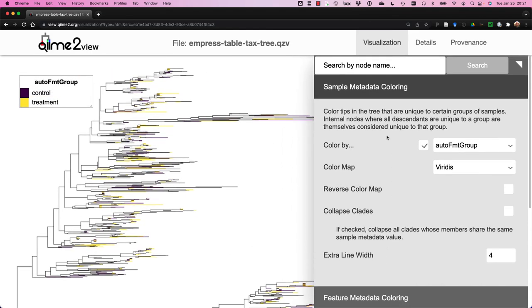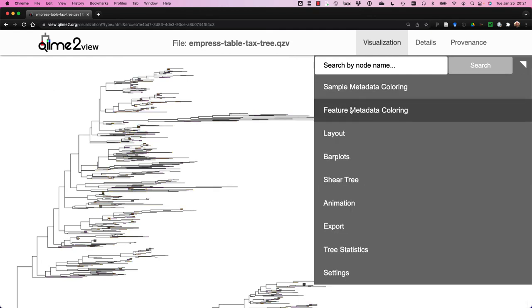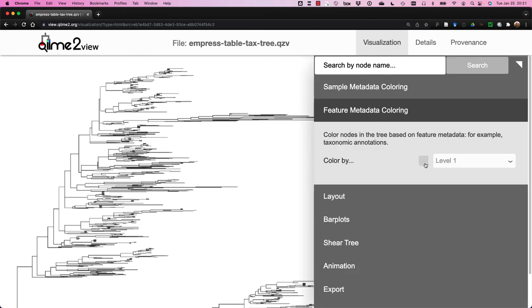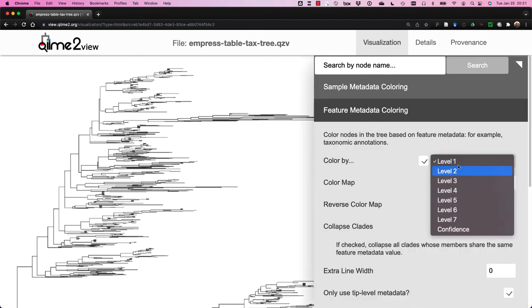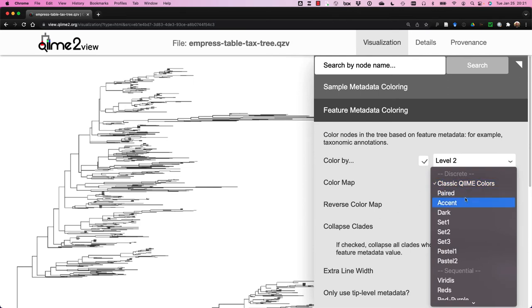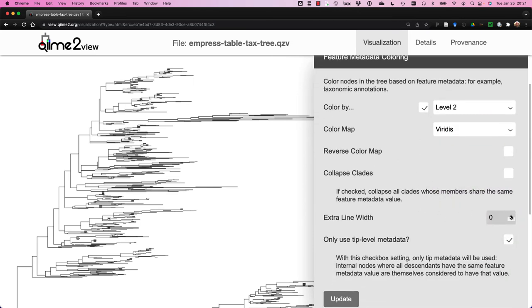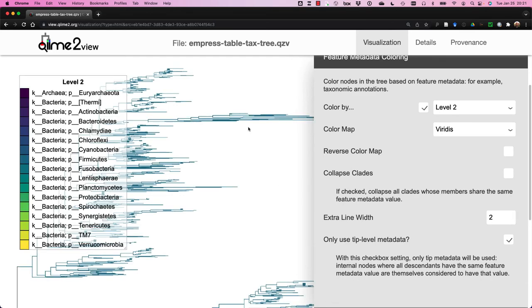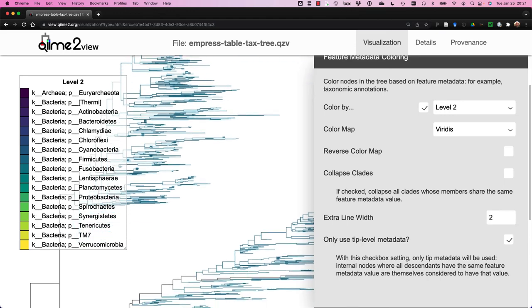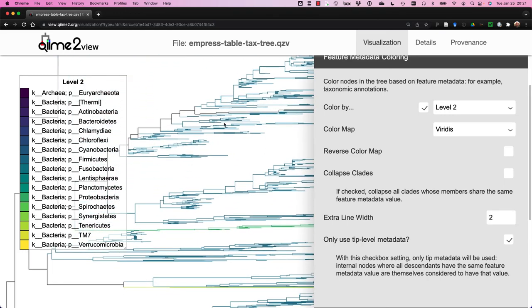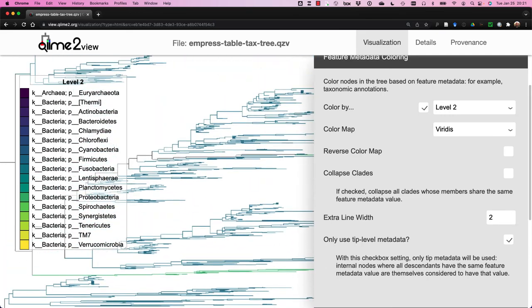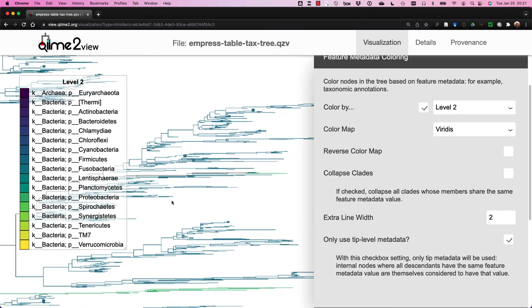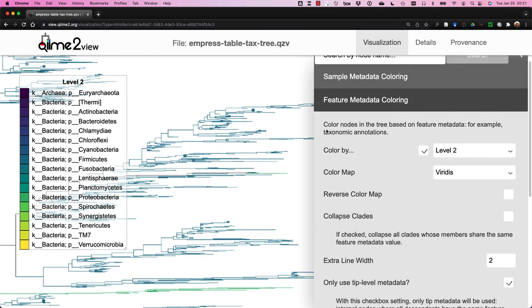Well, we can also color not only by sample metadata, but we can color by the feature metadata. In this case, we can color it by taxonomy. I'll just increase the line width of the colors. Now you can see the branches of the tree are colored based on the phylum level classification I've selected.